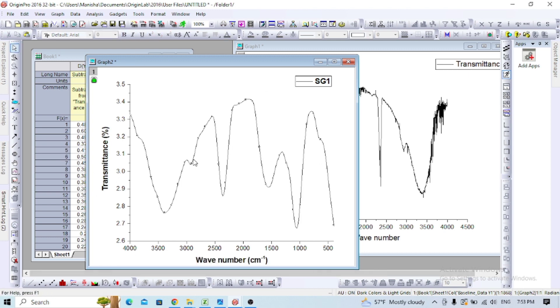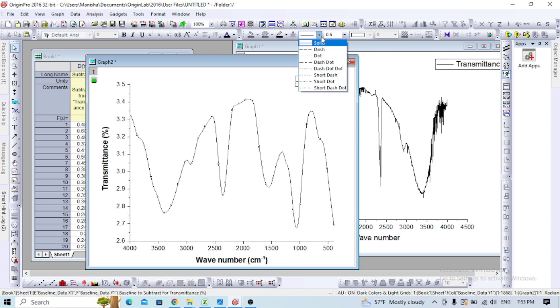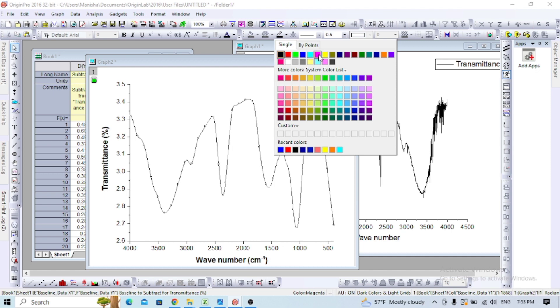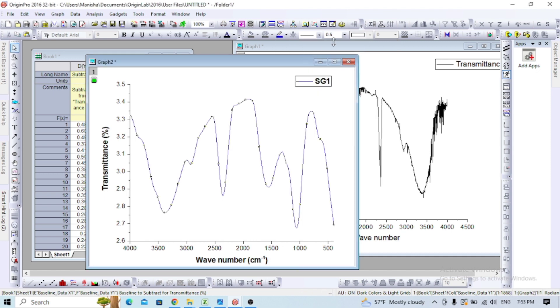You can change the color of the line as you prefer, along with the line width.